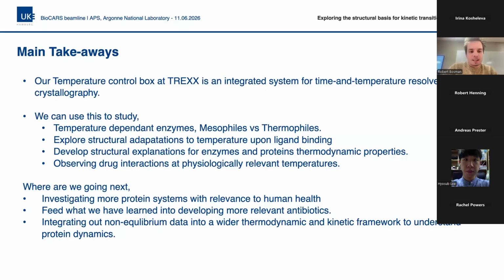And so the future is investigating more protein systems with maybe slightly greater relevance to human health, and then feeding back what we're learning in our structural studies into a wider kinetic and thermodynamic framework to better understand these subtle dynamics.